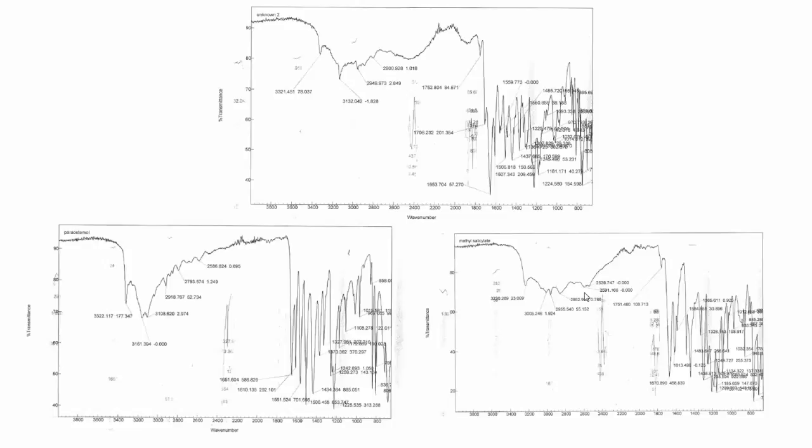Unknown 2. In a similar fashion to comparing compound 1 to the IR spectra of known compounds, we were able to identify 2 analgesics inside unknown 2. The peak at 3132 matches with the OH peak for methyl salicylate. Also, the peak at 2949 corresponds to a CH alkane stretch. We also identified that paracetamol was present in this unknown compound. The peak at 3321 matches with the characteristic NH stretch on the paracetamol, as well as a peak at 1653, which matches with the CO stretch.